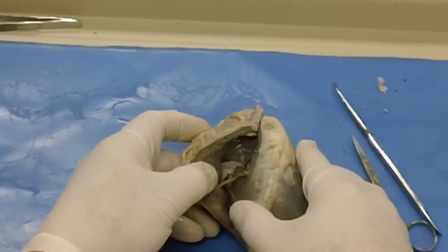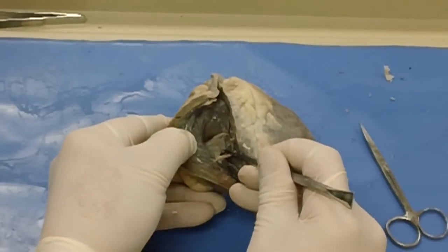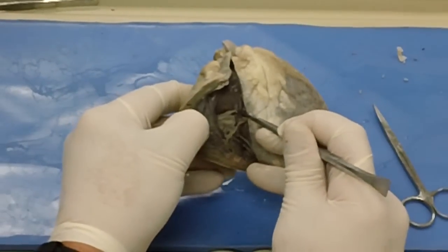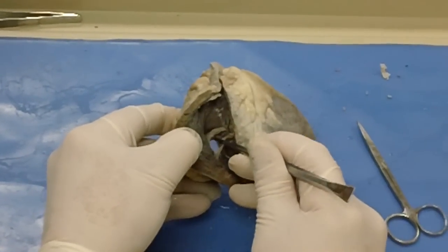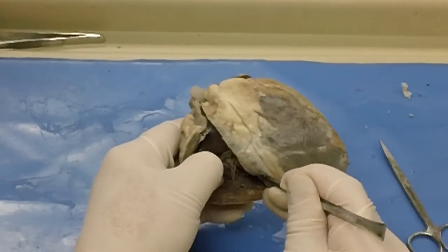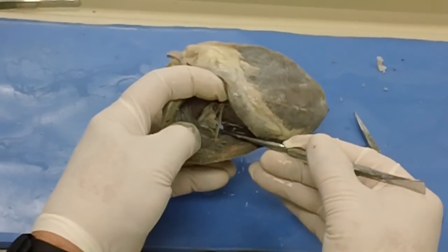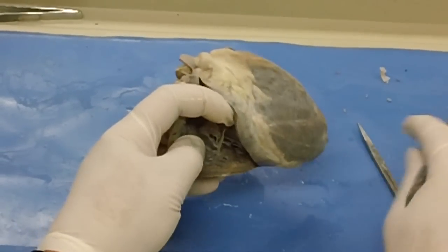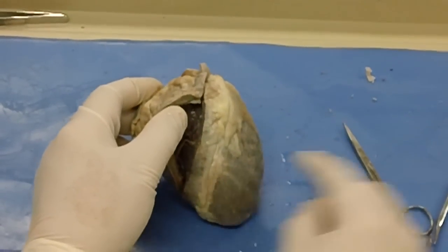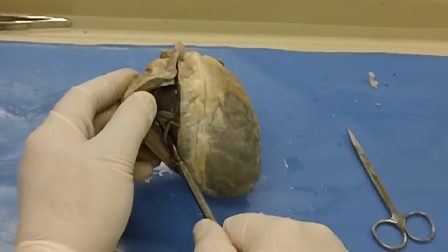That means this valve right here is which valve? Mitral? Nope. Tricuspid, right side. Tricuspid valve. There's one leaflet here, another leaflet right there, and the other leaflet is way inside there. See that one? There's 1, 2, 3. So that's coming from what structure? If I stick this up through that valve, what is the probe coming up into? Pulmonary.